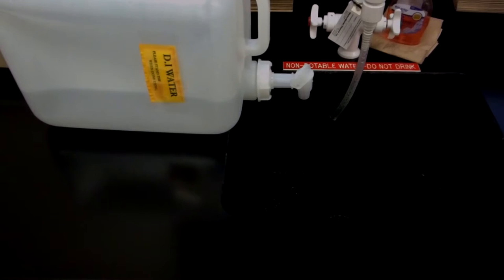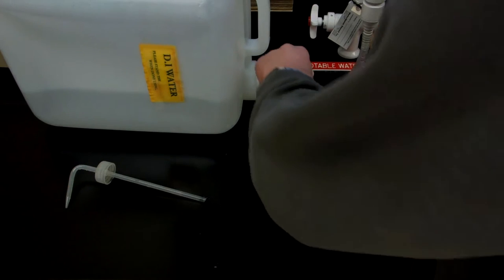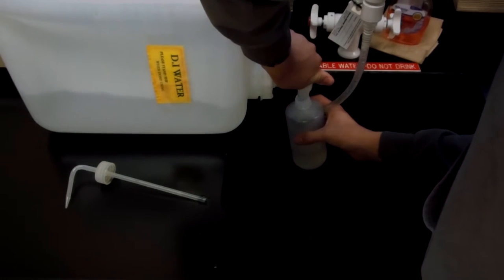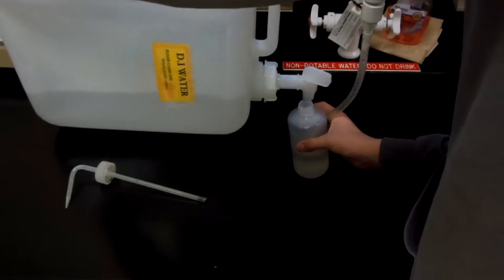So yeah, the first thing I will do is refill my wash bottle with deionized water. This special water has gone under a different process of purification than distilled water, and doesn't have any minerals or impurities compared to distilled water. As a result, this water has no chance of causing any undesired reactions from the trace amounts of minerals, and will fit the application I need.